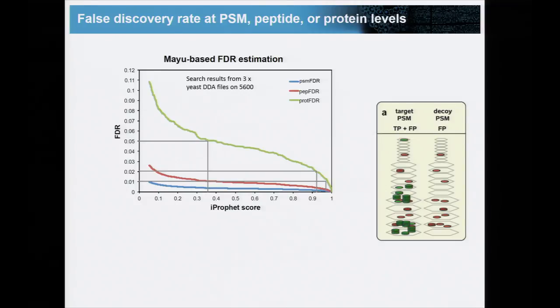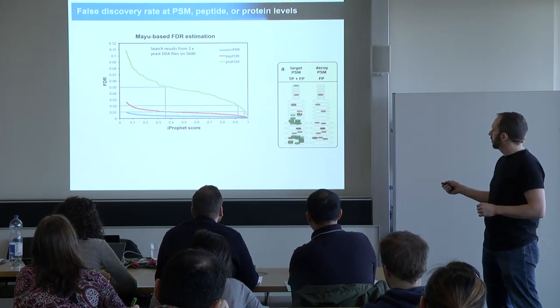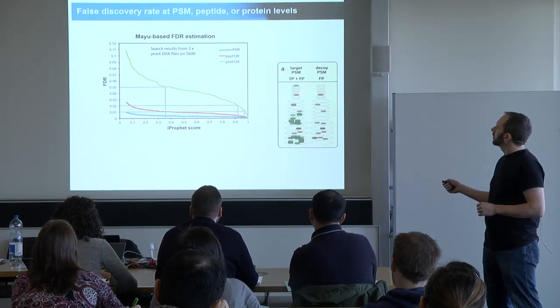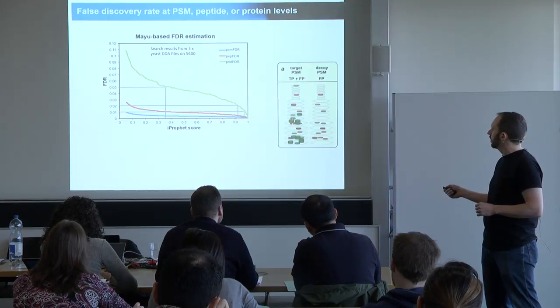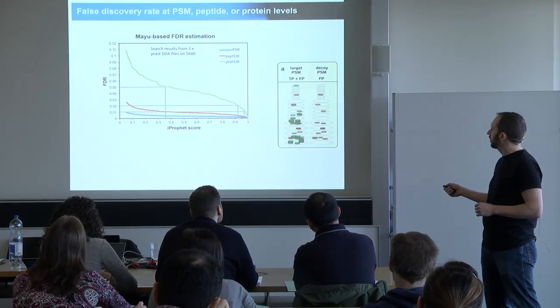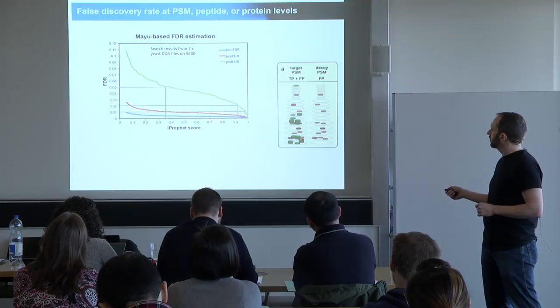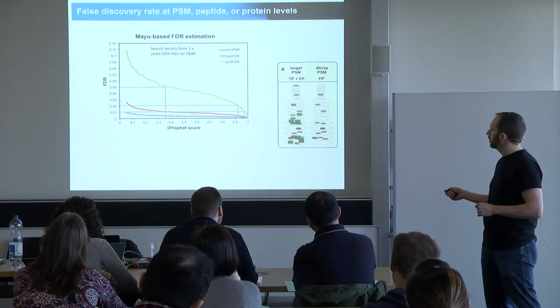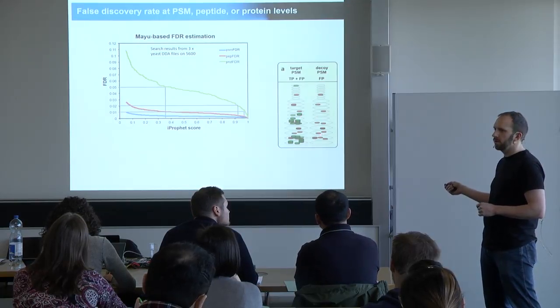at a fixed score threshold. And the reason for this, if you weren't aware of it, is shown in this diagram on the right, where each hexagon represents a protein, right? There are smaller proteins and bigger proteins, the green ones are essentially the true positives, and the red ones are the false positives. What you see is that the good PSMs, the good matches, tend to build up on specific proteins, whereas the false positives tend to be distributed across all the proteins.